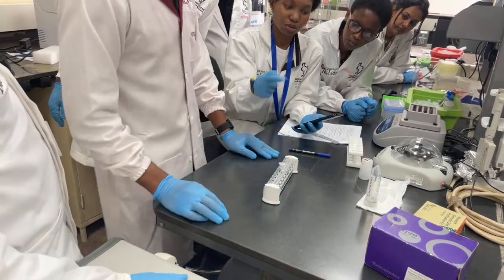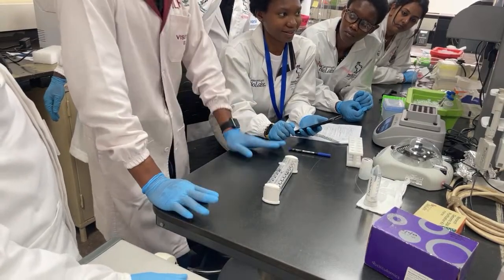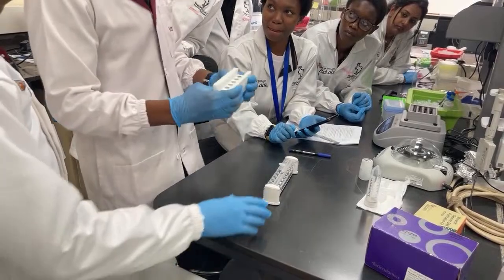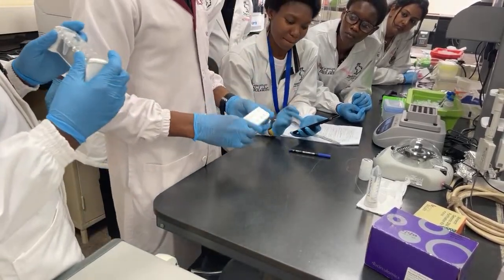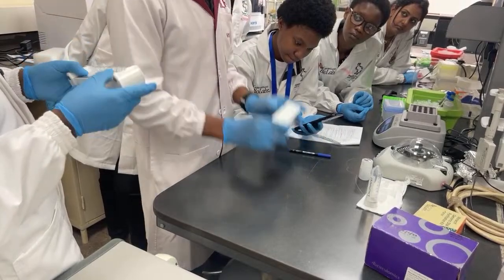Does that magnet come with the kit? No, you have to buy it separately. But can it be improvised? Yeah, you need experience, because the guys in the lab know it, so that's why they gave me this. They know it works as well. If you have this one as a starter, it's good. We also have this one, but this also works for us.